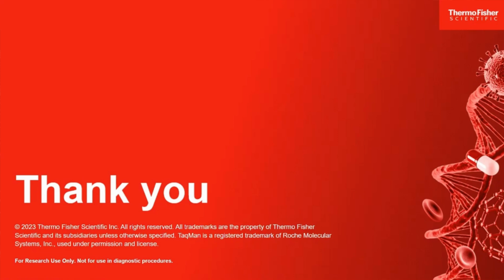So CT values can be used qualitatively, like we do in our COVID assay. If you see a CT, you've detected the COVID virus, and if you don't see the CT, the COVID virus is not there. I'm speaking very simplistically for this particular application; there's more to it than that.